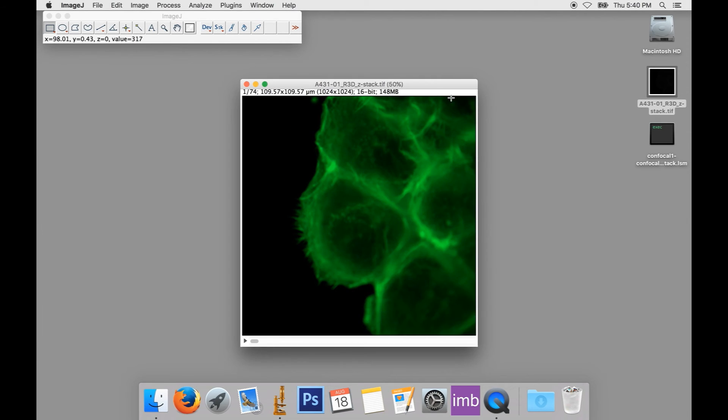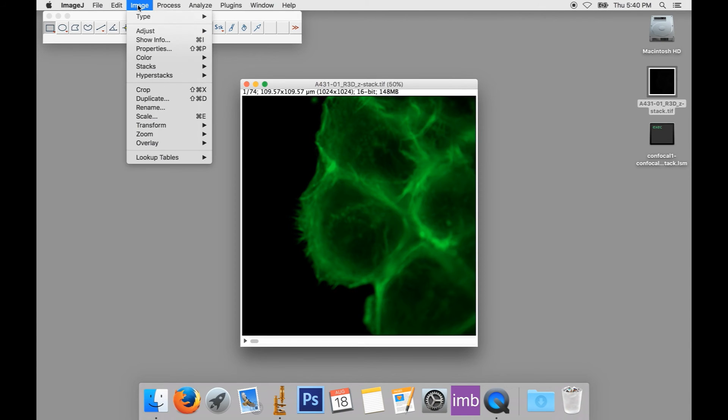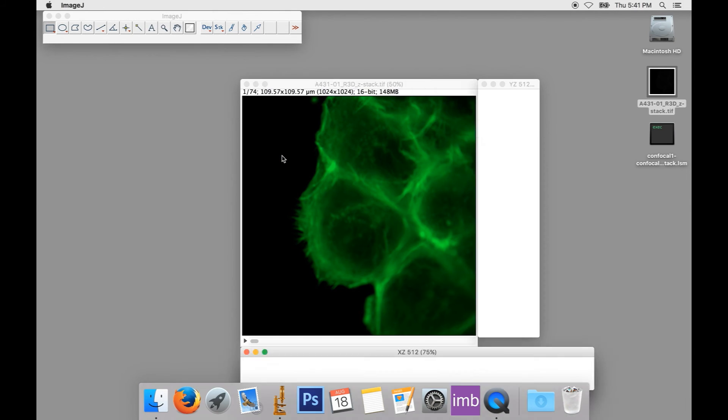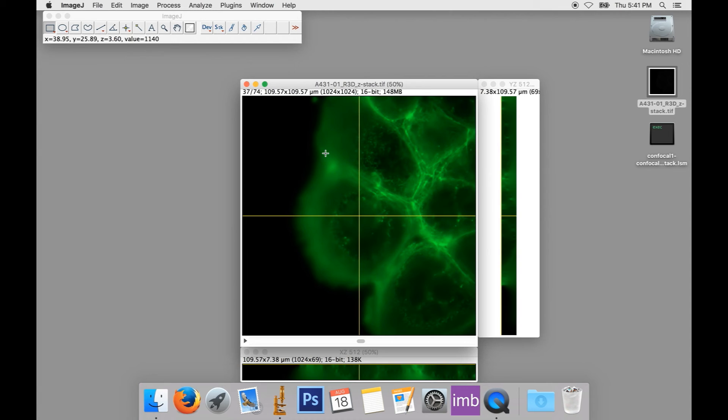There are other ways of displaying your 3D data. Another standard way is to use orthogonal views, showing three slices through a single point, each at right angles to the others. To obtain this kind of view, from the menu, select Image, Stacks, and Orthogonal Views. This will give you three image windows. One, the standard view from above, and the others are views from the sides. Each image has two yellow lines in it, showing where the other two views are in relation to it.